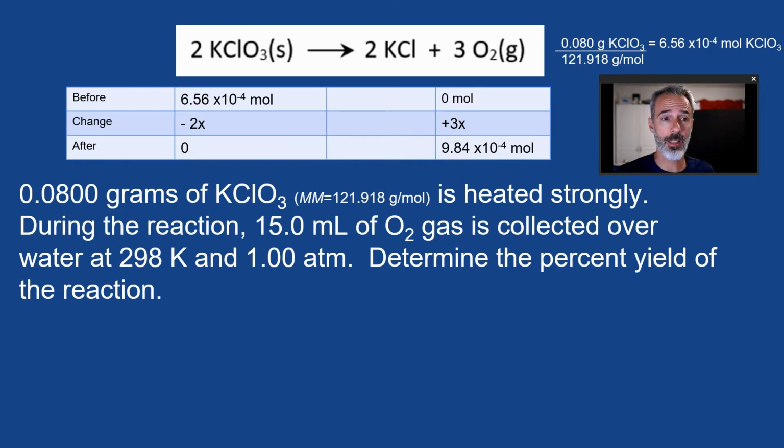Notice I didn't do anything in lab. I could have calculated this before we even went into lab. So it's only how much you should make in theory. Now you all know, because you already did the calculation, did we really make this amount? I don't think we did, did we? And it's pretty uncommon in lab to actually get 100%. So let's find out what you guys did.